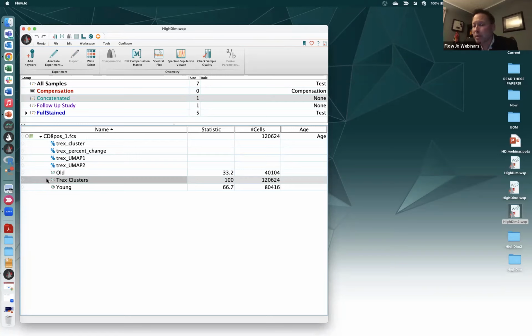If you trim out the white spaces at the edges, maybe even put a good width basis on your negative population to minimize the variance across the negative, so you say that differences in negative are less interesting than differences in actual antibody binding in the positives, that'll give you a nicer result. So just a moment to say it's probably worth taking a look at your transforms, making sure everything looks good, is on scale, and you've trimmed out any excess white space. And then we will start the algorithm.